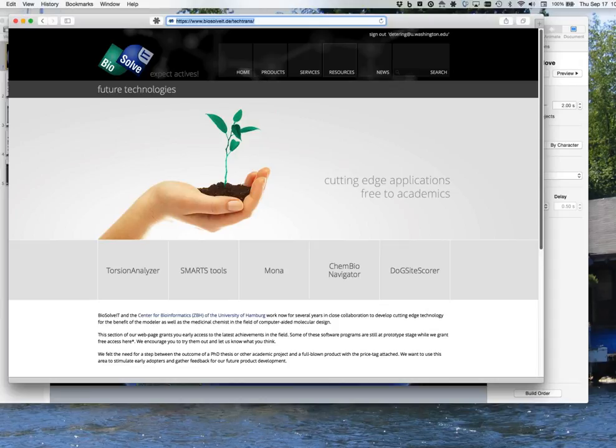Okay, then another one asked if it's recommended to remove the water molecules, because in other tools such as AutoDock, they actually recommend to remove the water molecules. Can you say anything with respect to that? So yeah, if you're in the docking scenario, it depends a little bit. If you do not do any analysis of the water molecules, it's certainly good to remove the water molecules, especially in redocking scenarios when you just want to see whether the docking does the right thing.